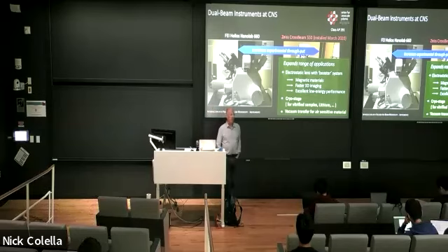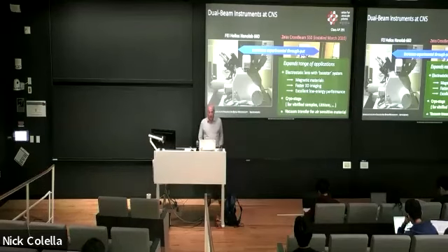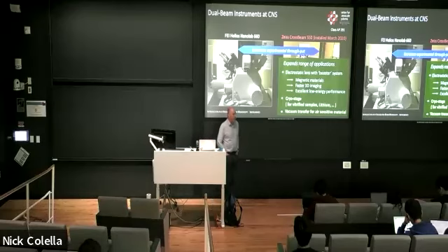So with lithium, we also have to work at cryogenic temperatures to produce the sample with the necessary quality. We have some of these tools already running, and we're building now all the consequent workflows that we need to access those materials.